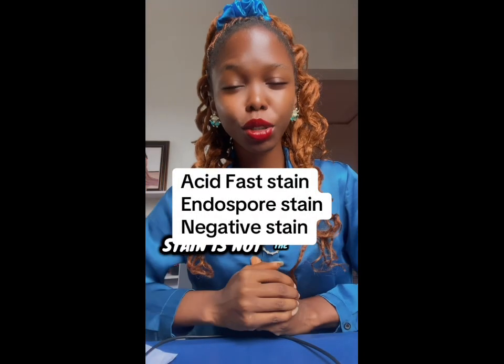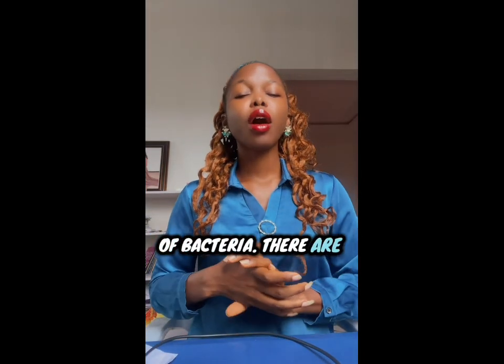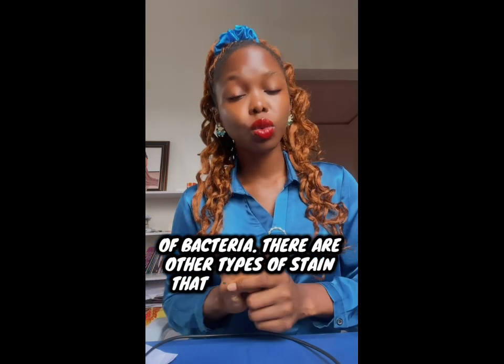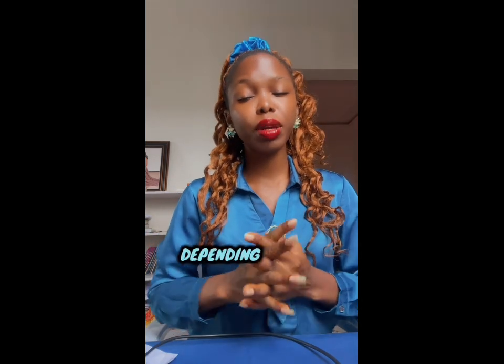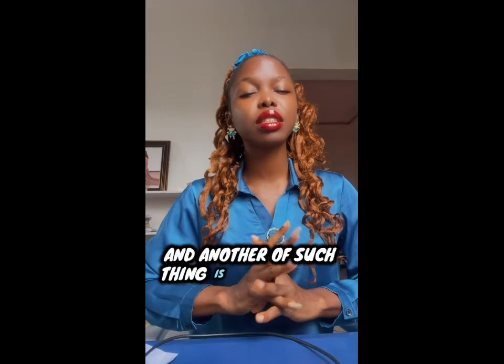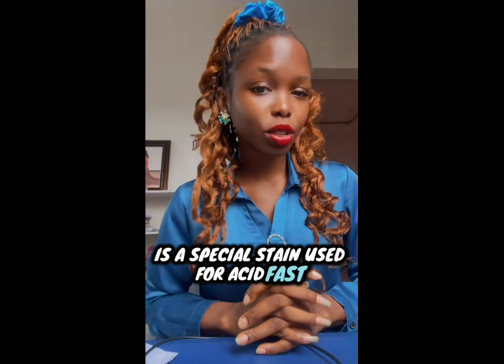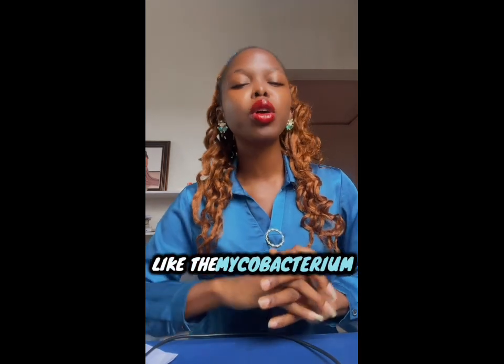The gram stain is not the only stain used in the identification of microorganisms or bacteria. There are other types of stain that we can use to identify microbes depending on the structure of what we are trying to identify. Another such stain is the acid-fast stain. It's a special stain used for acid-fast organisms like Mycobacterium tuberculosis.